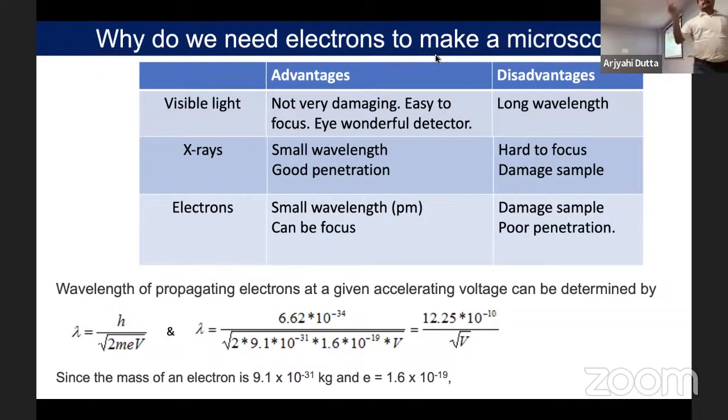Now, as I mentioned, in the early days, even in the last 7-8 years, I faced a lot of problems like that. You can use lower voltage for biological samples. You cannot use 300 kV for biological samples. But 300 kV is good for biological samples because your lambda will be smaller and penetration power will be much higher. That is the reason most of the cryo microscopes you can see in good condition are 300 kV microscopes. People are talking about that, we want a 300 kV microscope. Okay.